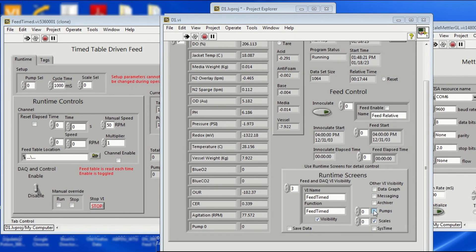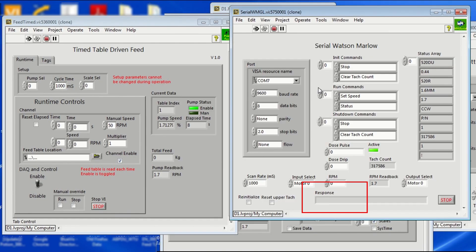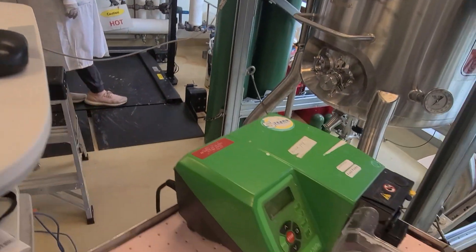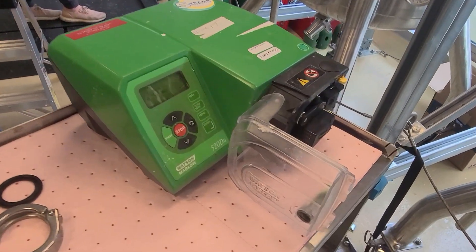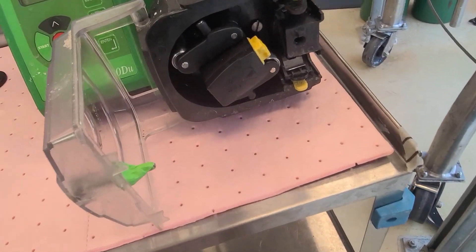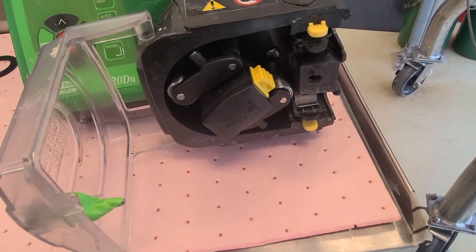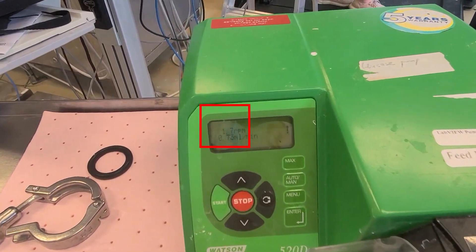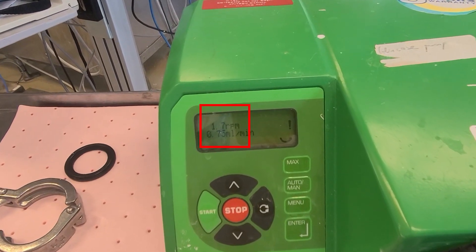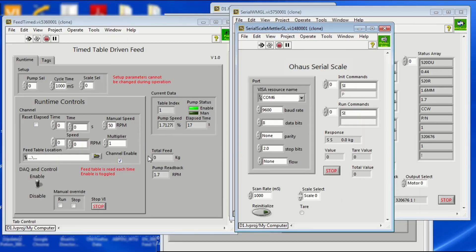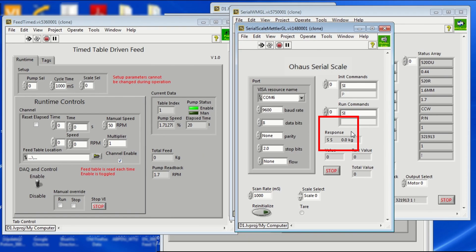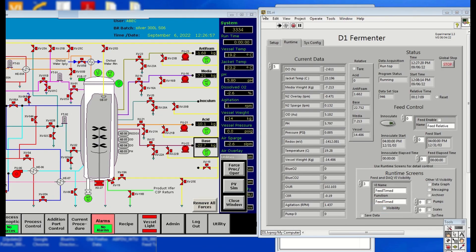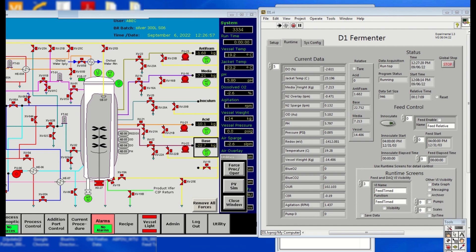Check the Pump and Scale boxes again. Additionally, check that the physical pump is turning accordingly and that the Pump RPM is the same as in LabVIEW. Click on Visibility again to hide the Timetable-driven Feed panel.